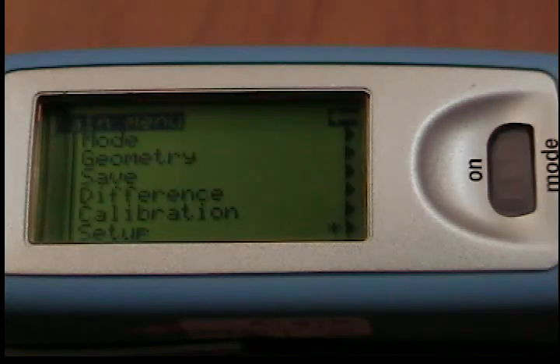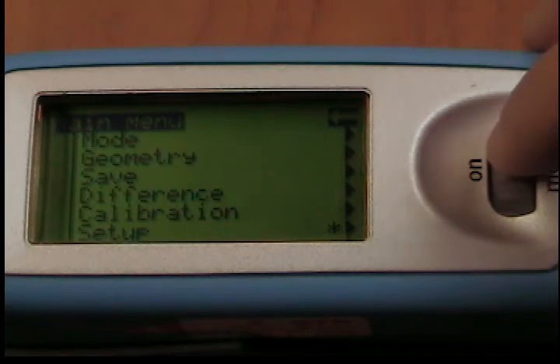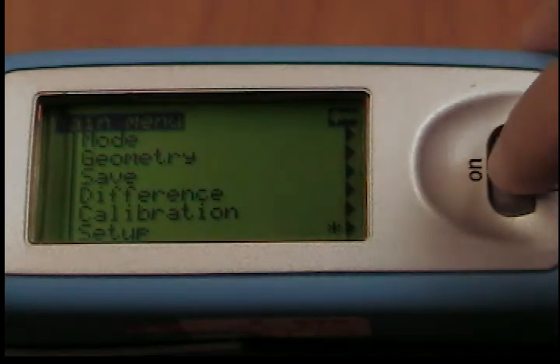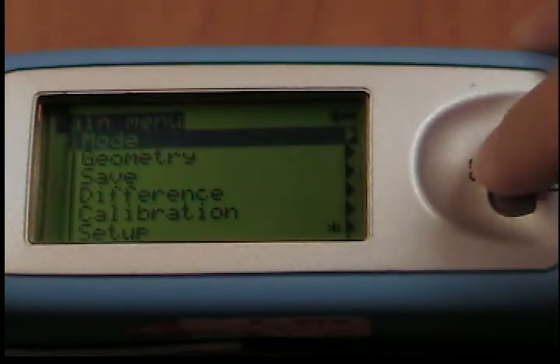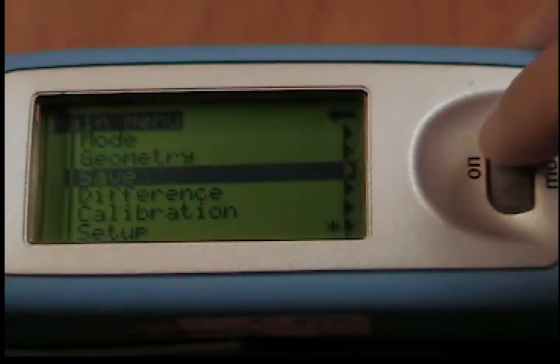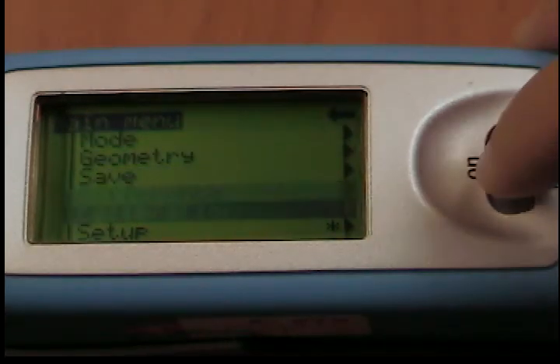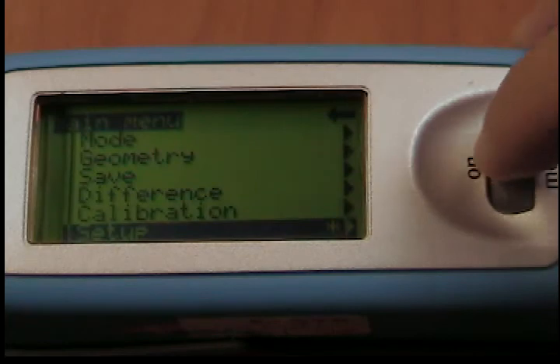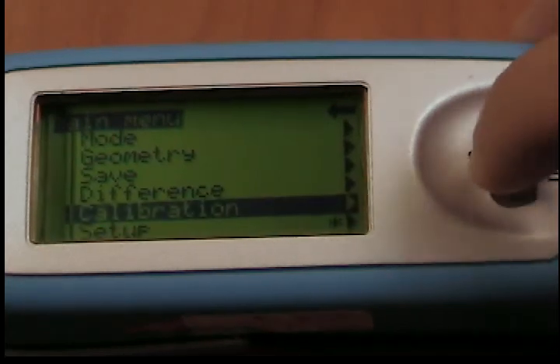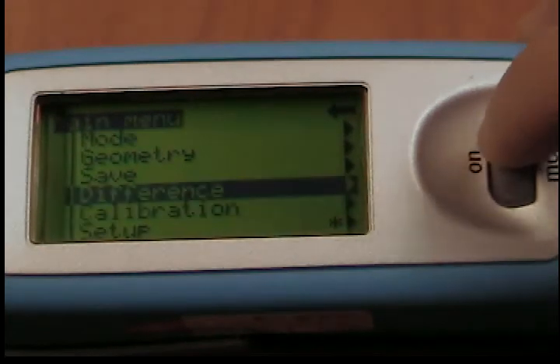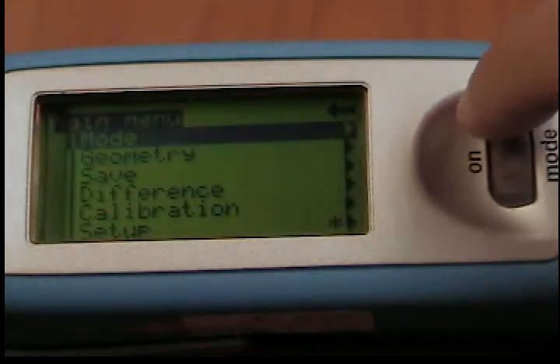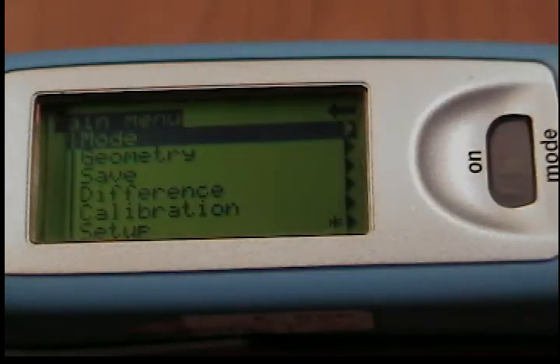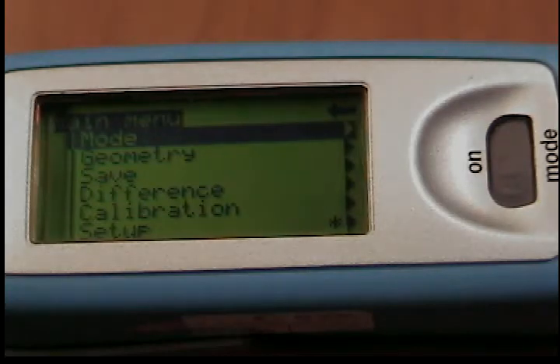Turning the wheel allows you to move the black mark to the desired functions and to select or activate by pressing the wheel. What functions are displayed in the menu depends on the settings in the main menu. The main menu is the central level and can always be reached quickly.